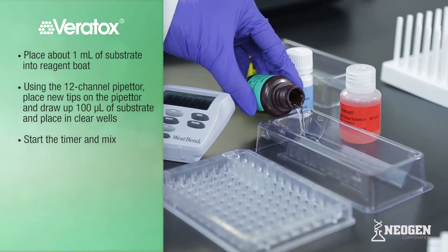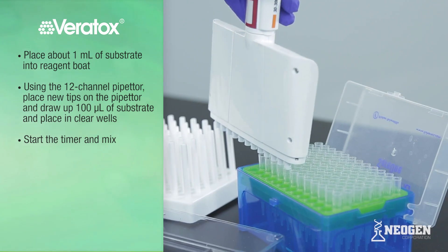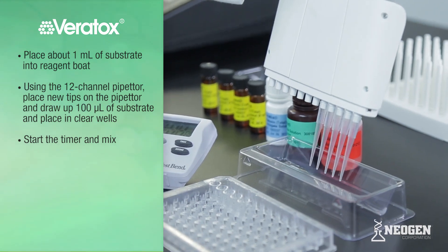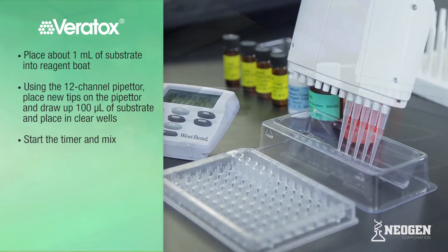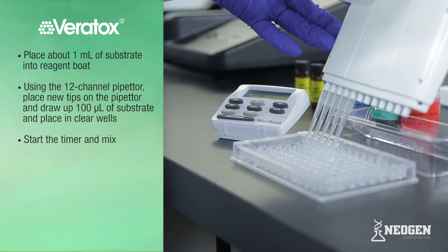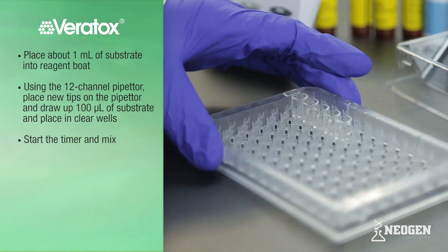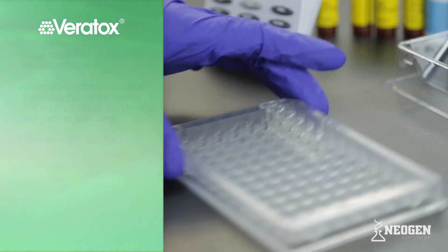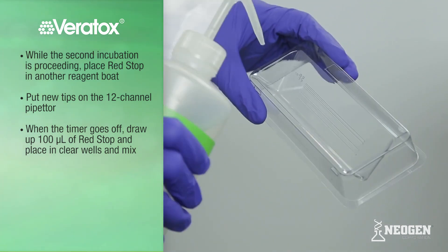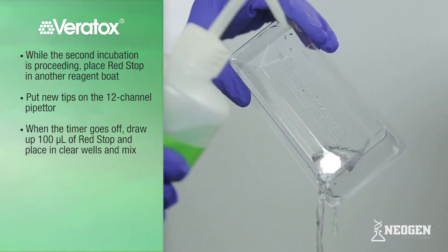Place a small amount of substrate into a reagent boat based on the number of wells. Using the 12-channel pipetter with new tips, draw up 100 microliters of substrate and place in the clear wells. Start the timer for 3 minutes and mix by sliding back and forth for 20 seconds. Refer to the test kit insert for specific timing of other mycotoxin test kits. Discard any excess substrate from the reagent boat and rinse clean — do not pour back into the substrate bottle.